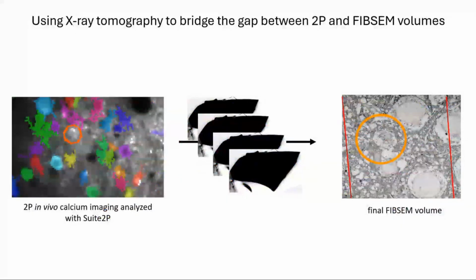And now that we know the aim and the workflow of our experiments, let's get back to the problem. How do we find the cell in those sliced up dark sections?